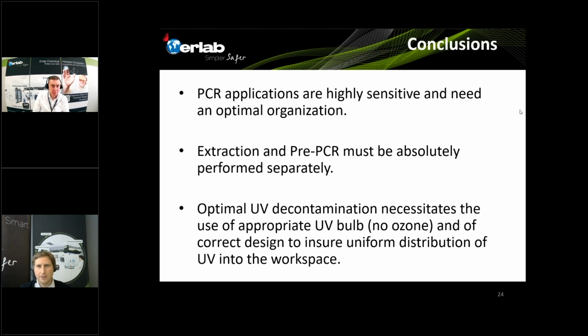Question from Victor Debas: can you explain to me what a dead air box is and what's the purpose for it? The 320. I've seen it being spec'd here and there, but I couldn't understand. I assume it's a PCR cabinet without any ventilation.